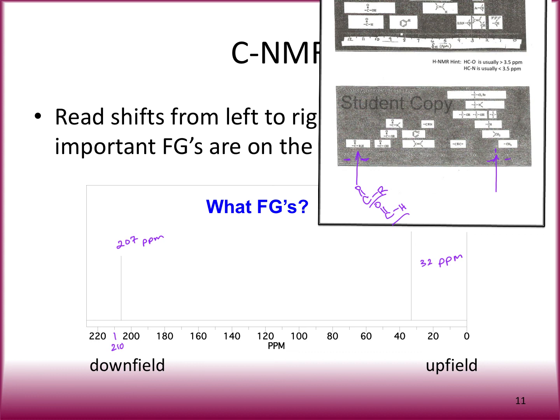And then if we look over here, basically there's lots of things. There's just regular carbons attached to carbons. That's these guys. There's things attached to OHs and NHs and halogens. The thing it doesn't show is there's also things that are attached to a double bond, but like next to it, so like this. So that's another option that we could have. So generally, this is the thing that could be in the same range. And that's actually what this one is. If it's got a double bond O, it probably has something next to the double bond O, so that's what that one's going to be.